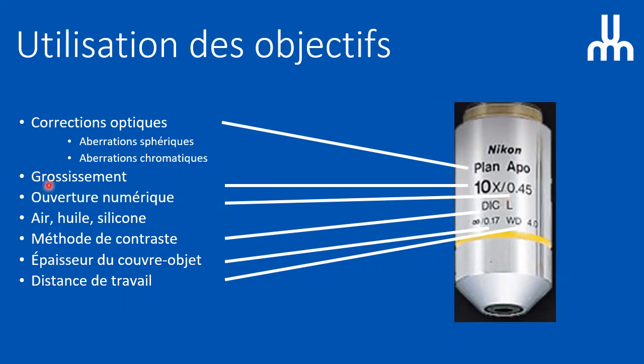The magnification is actually a very subtle term. What I like better is this: if you use a low magnification objective, you're going to see a wide field of view. This is sometimes interesting, but it doesn't give you better resolution. What gives you the resolution is the numerical aperture. They are both linked somehow, but if you want resolution, just keep in mind the numerical aperture. If you want to see a large field, then choose a lower magnification objective.